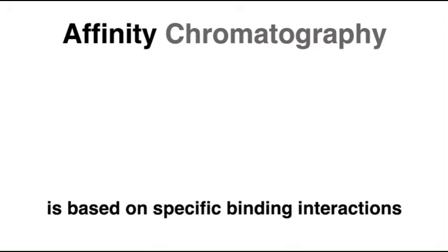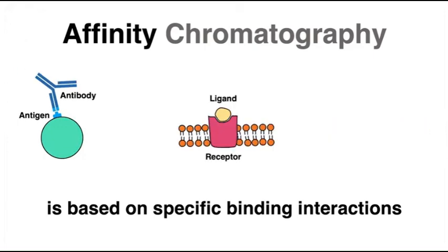Affinity chromatography is based on specific macromolecular binding interactions between two biomolecules. This can be antigen-antibody interactions or receptor-ligand interactions, but also the binding affinity of an enzyme for its substrate.